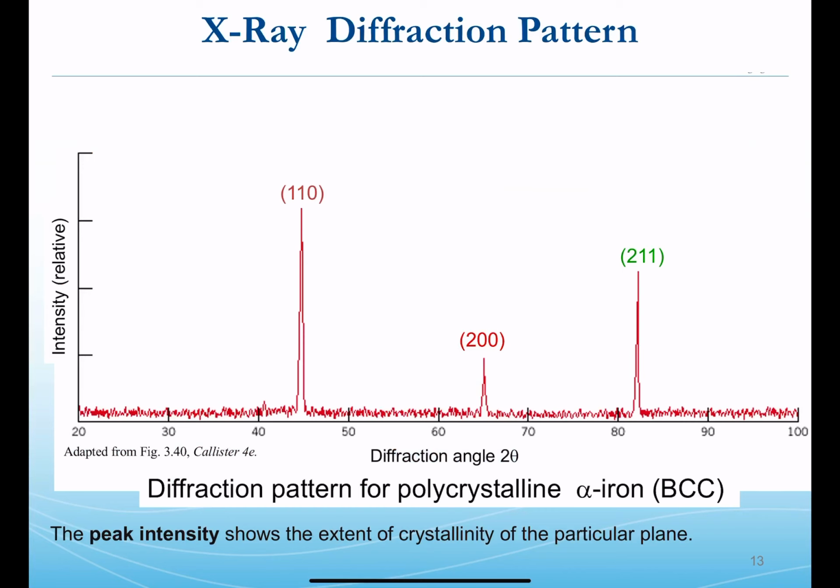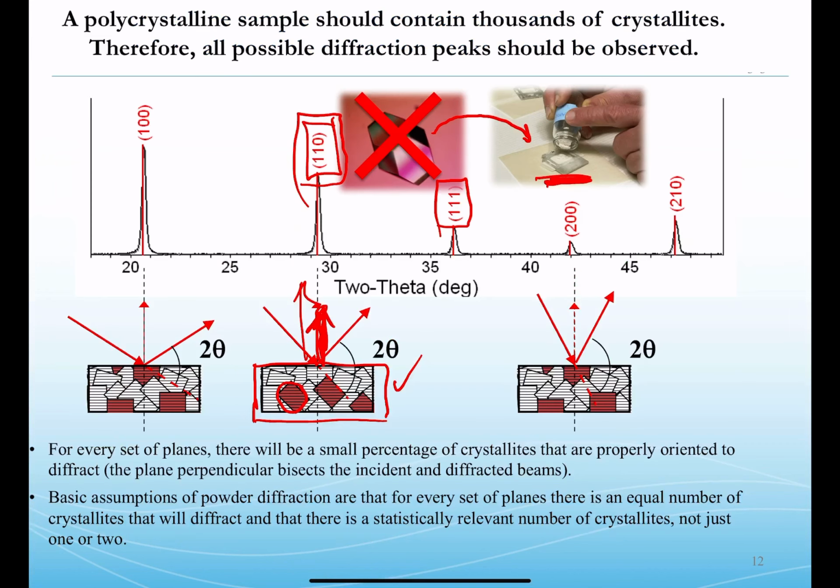We mentioned briefly that the sets of atoms is responsible for how high these peaks are. And the next piece we'll consider here is that the peak intensity is also related to how many planes we have available to help us with the diffraction. So in other words, how big are these crystals? If that red crystal there is very large, we have many sets of planes.